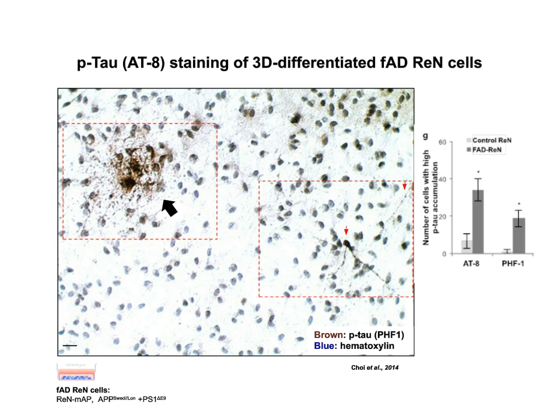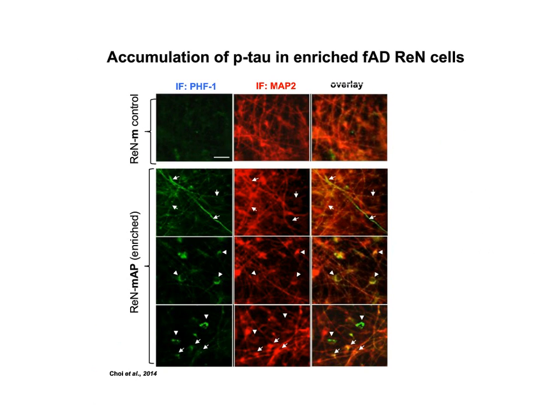And this is another immunofluorescence staining, but this line is actually a more enriched line, similar to the one I showed you. So we see more robust tau pathologies. In the left section, you can appreciate there is green phospho-tau staining elevated in the AD cell line as compared to the control.